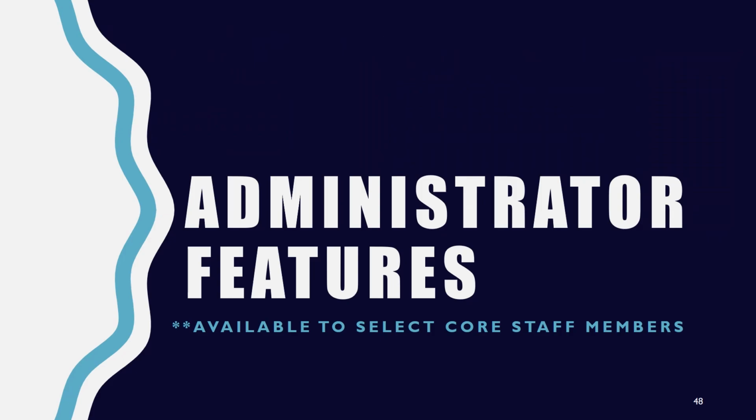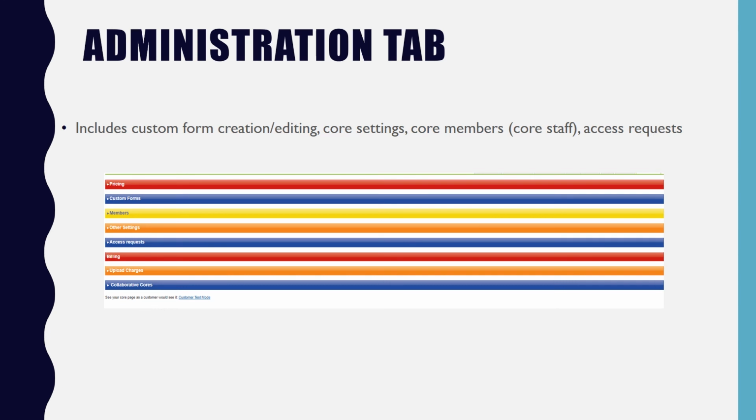Finally, I'll cover some administrator features. These are available to select core staff members. The Administration tab includes custom form creation and editing, core settings, core members, which here specifically refers to core staff, and access requests.